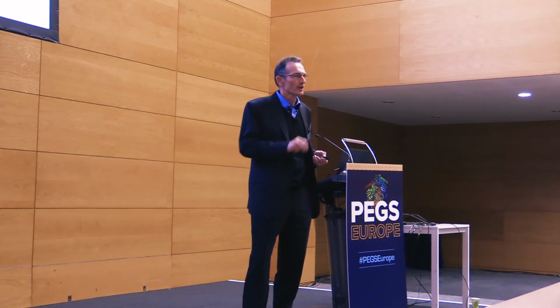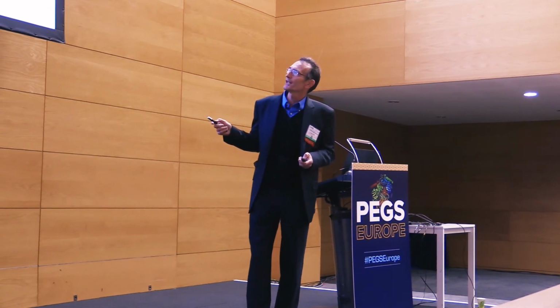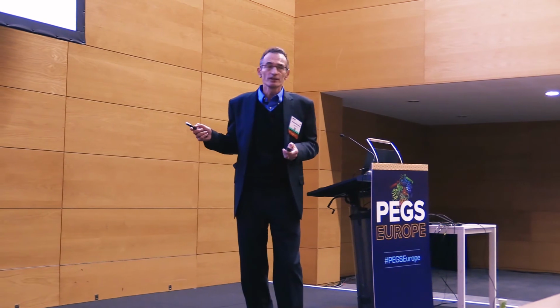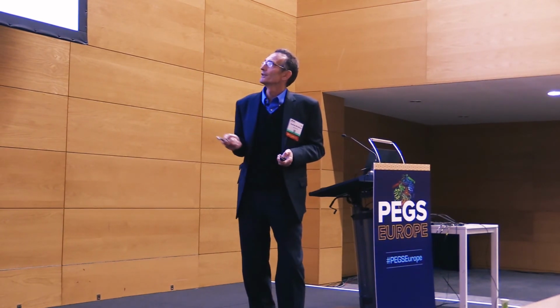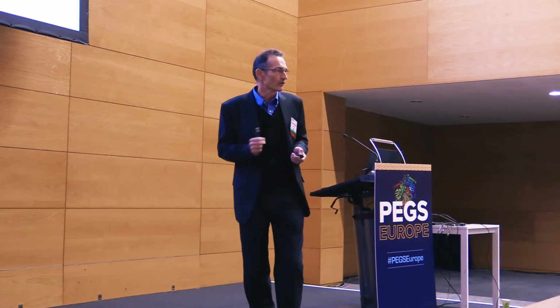What about those sequence liabilities that we eliminated? This was our generation 1 library. You can see that 8% of the antibodies coming out from a selection here had 5 liabilities or more. 75%, 3/4 of them, have 2 to 4 liabilities. 6% have 1 liability, and 0.1% have liabilities in HCDR3 only, and 9% have zero liabilities.